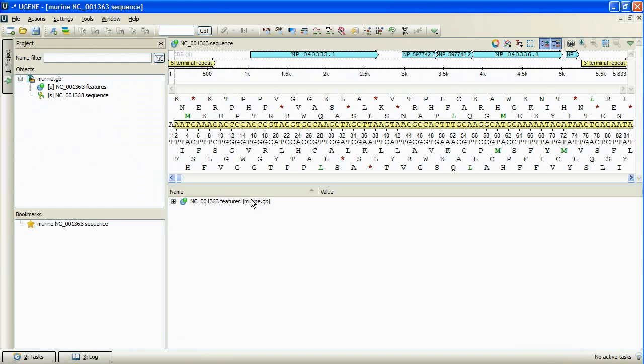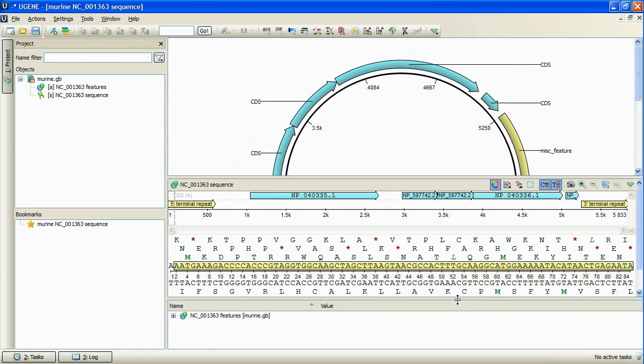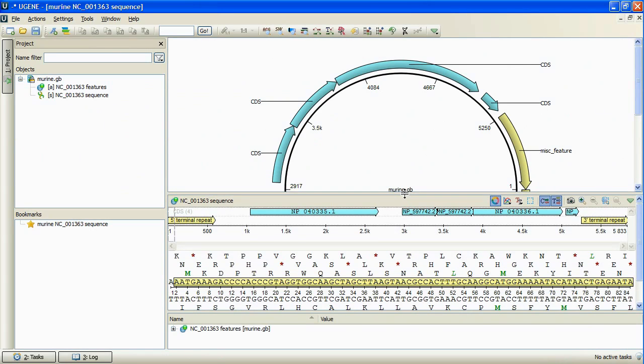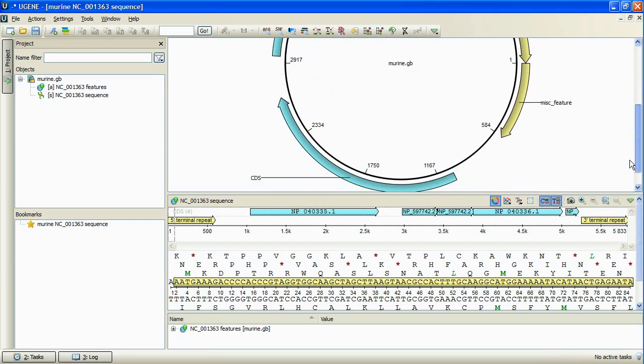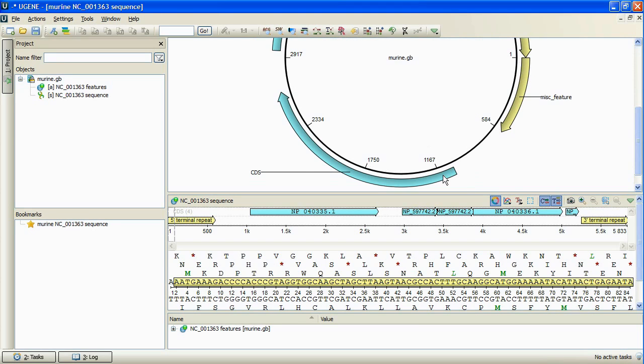There is a new icon at the Sequence View Toolbar. Pressing it, we toggle the circular view. The view is active now. The inner circle represents the sequence clockwise, and the scale marks show the corresponding sequence positions.